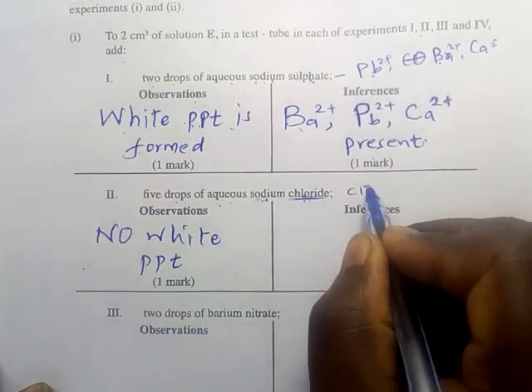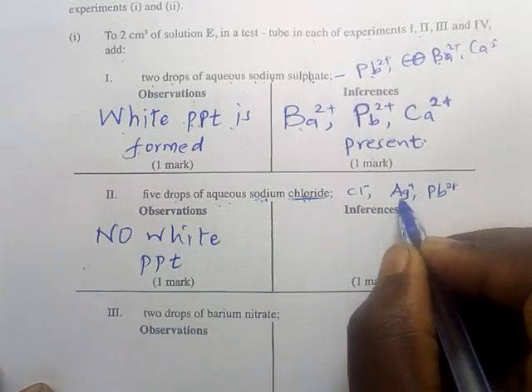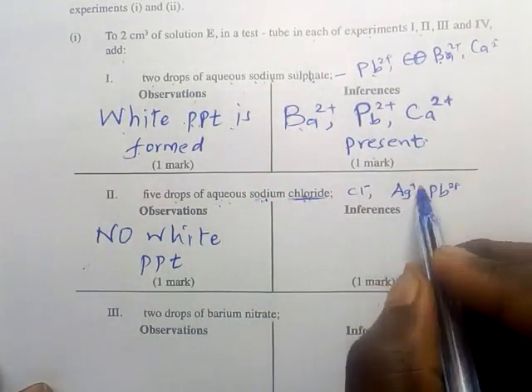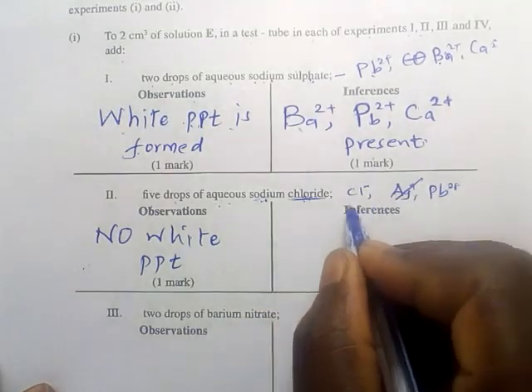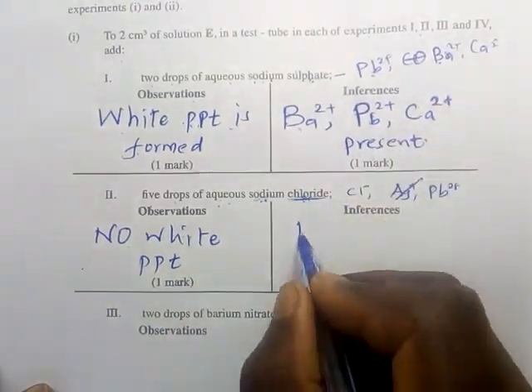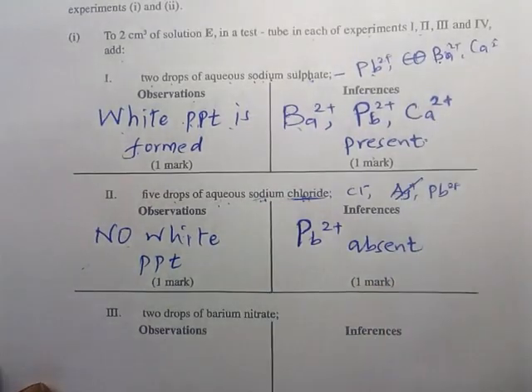The chloride ion will form a white precipitate with silver, with lead, right? But from our previous, we don't have silver. So we are not going to include silver, because that one will be called a contradictory response or answer. Therefore, it means if there is no white PPT, the lead we thought was present here is absent.